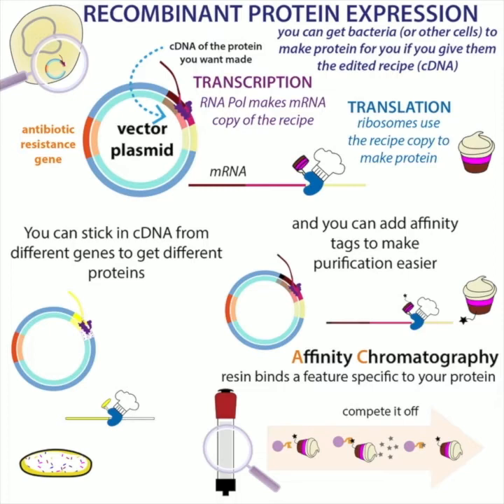But before you can actually get to the purification stage, the protein might express, but it misfolds and aggregates or clumps up into things called inclusion bodies, which are clumps of protein inside the bacterial cells. The protein could also get degraded and that sort of thing.